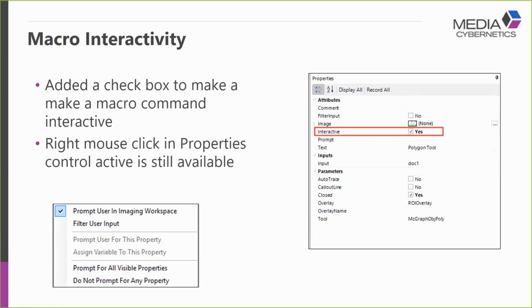The great thing about macros is if there's some type of interaction where people are going through the same set of operations over and over again, it's really a great way to simplify processes, make a better user experience, and just, people can get in, do the work, and get out. So again, it's a great enhancement from a usability standpoint. So let me just quickly show how this works.